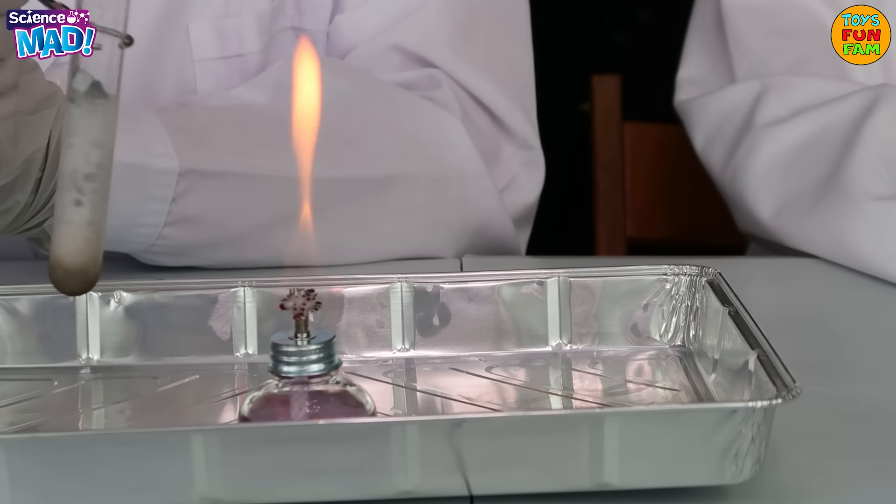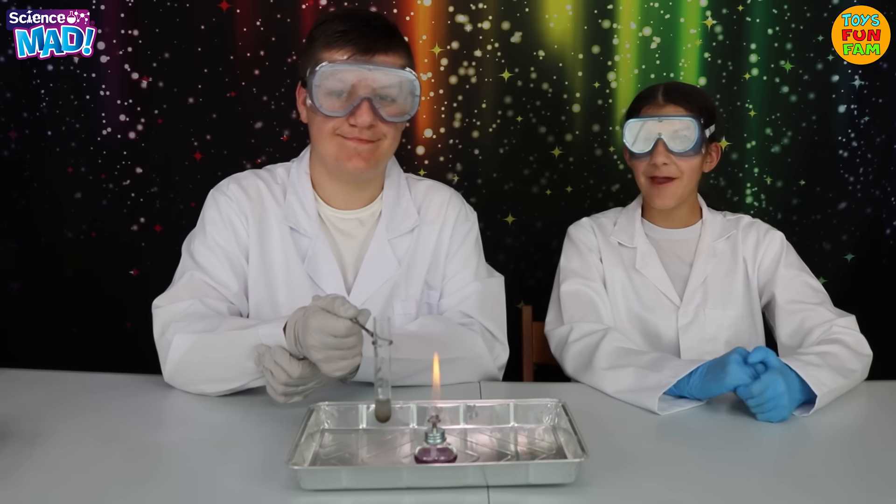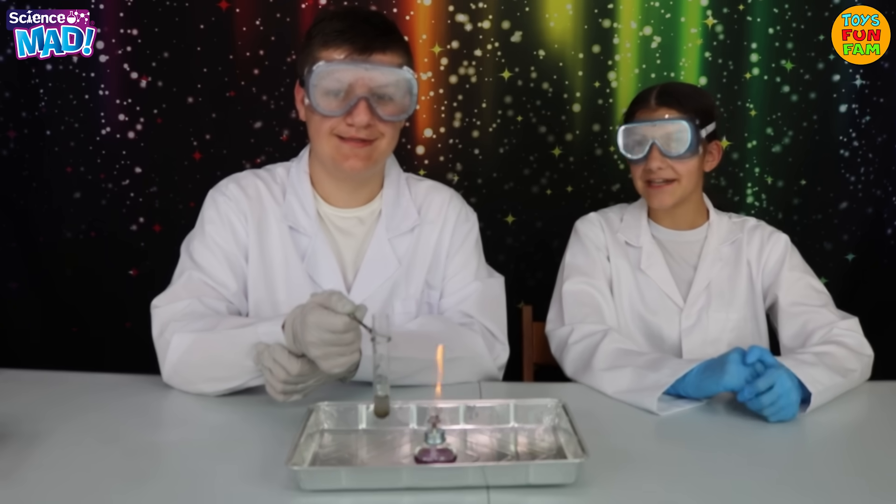This gas is called hydrogen! In this experiment we've actually produced hydrogen! How epic is that?